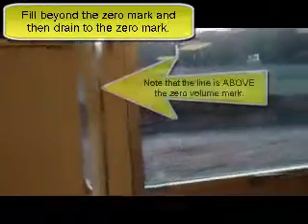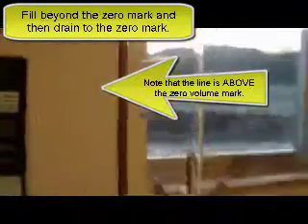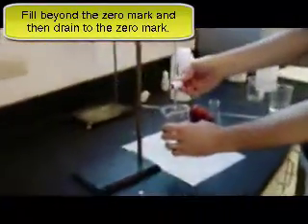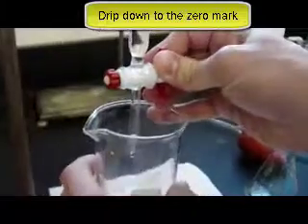So I'm above the zero, but I don't want to start above the zero. So what I'm going to do is get a little beaker for waste. It's called the waste beaker. Just keep one around that you can dispense waste into. And you're just going to get it right down on the zero to start. Bottom of the meniscus right on the zero. All right, did I get it? Pretty close? Okay, so now we're ready to start.